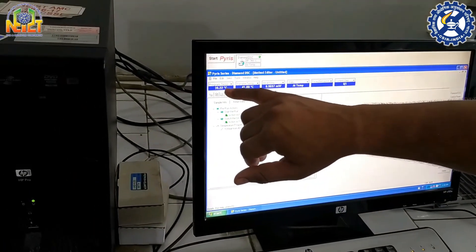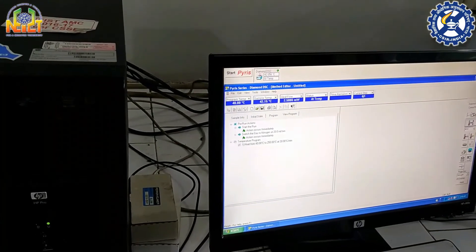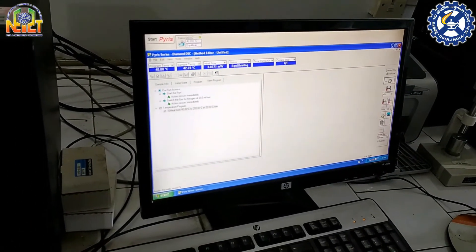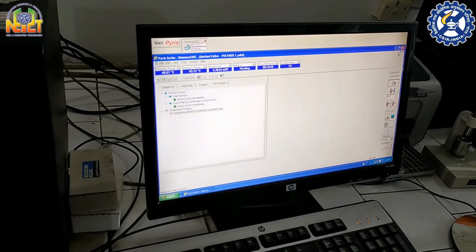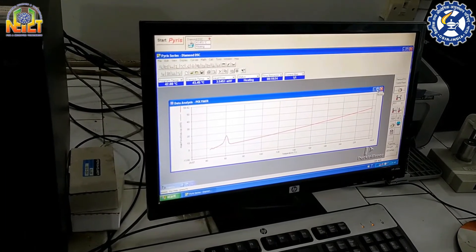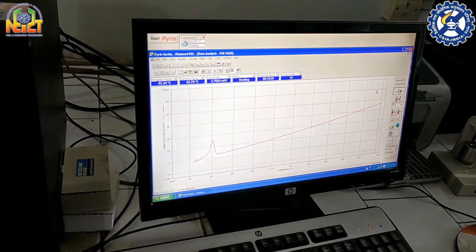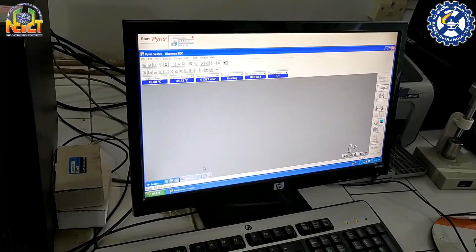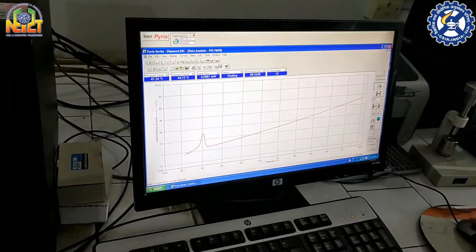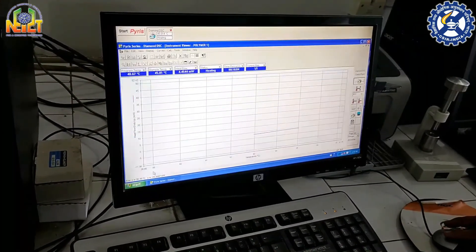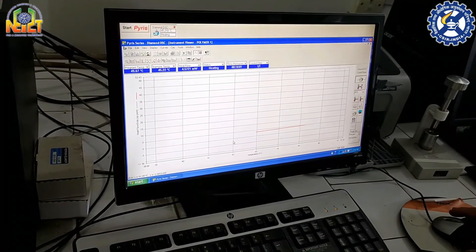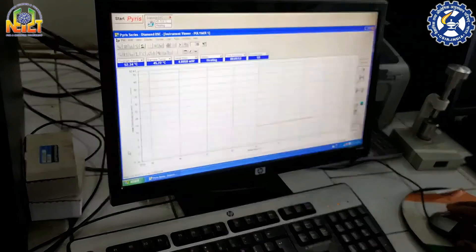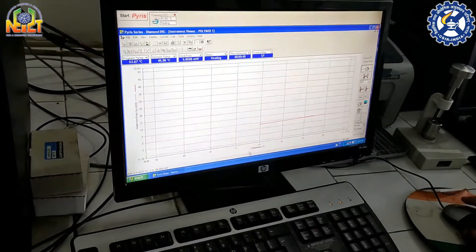The temperature is increasing up to 40 degrees centigrade and our sample run has started. The result is coming — this is the heat flow versus temperature curve.